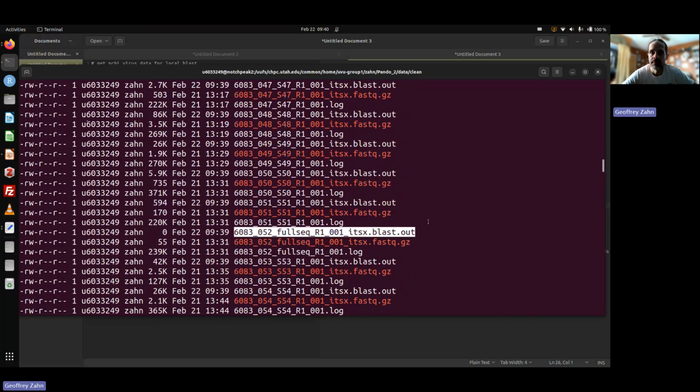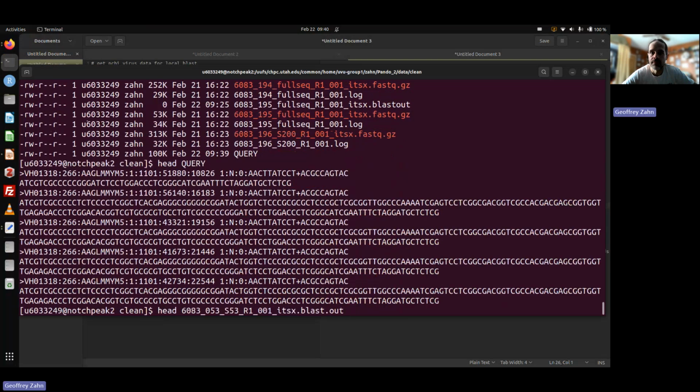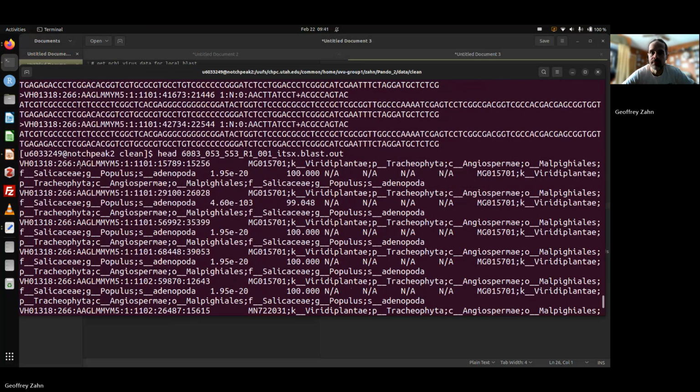And there we have blast out popping up. Ooh, one of them's already returned some stuff. Let's look at that. Oh dear. Okay. My query, the ID of the best hit, and then the information about it.